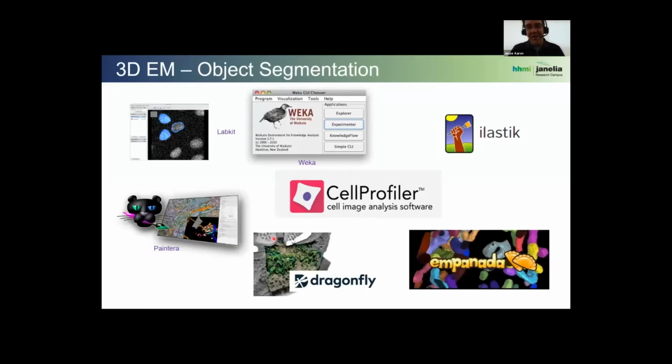And then, it should come as no surprise, therefore, that there are just a ton of machine learning segmentation software out there. And most of the commercial software developers also have their own implementation.